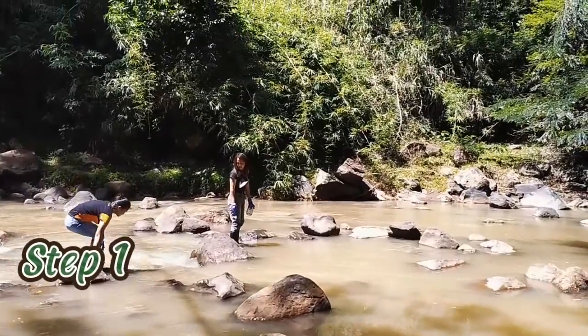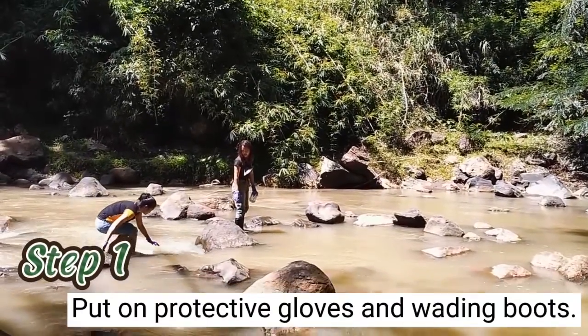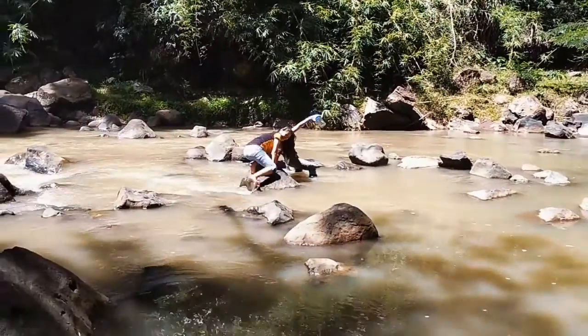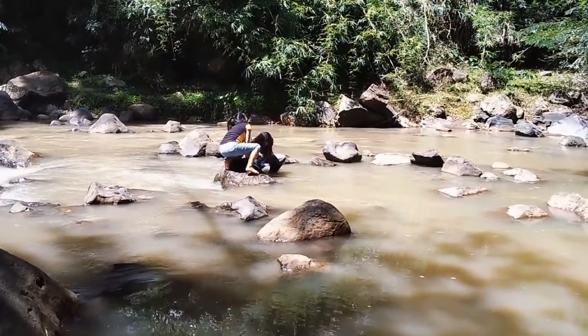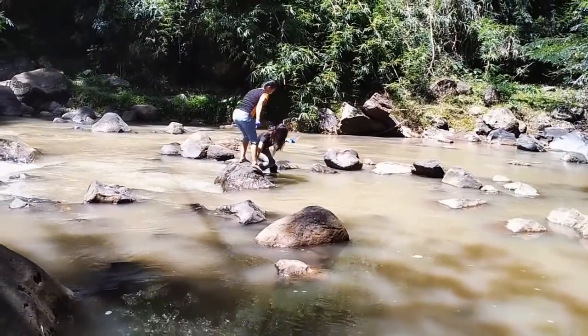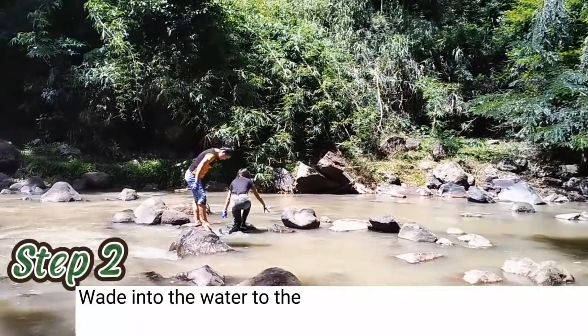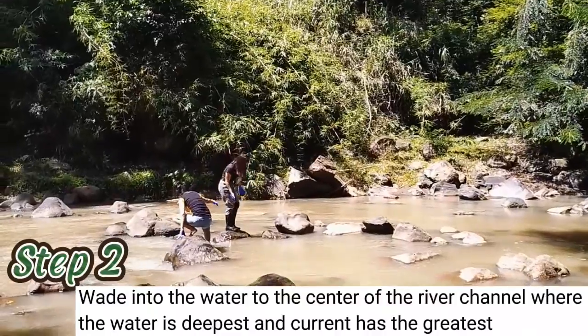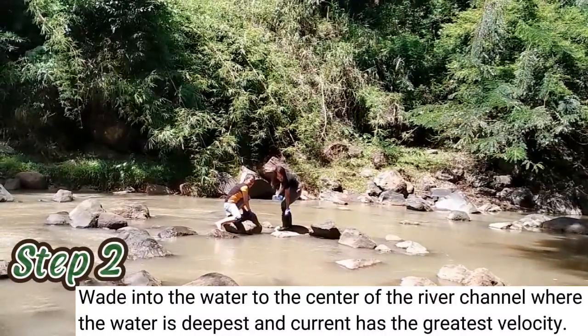Step 1: Put on protective gloves and wading boots. Step 2: Wade into the water to the center of the river channel where the water is deepest and the current has the greatest velocity.